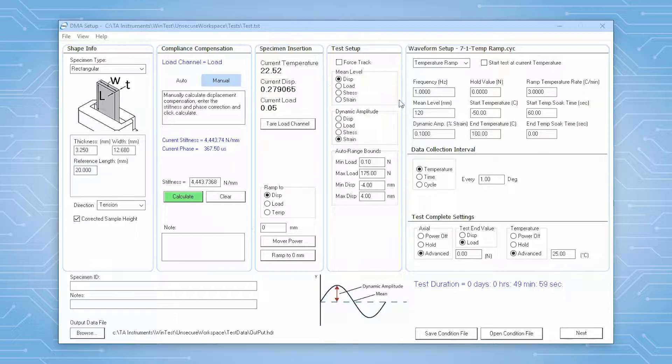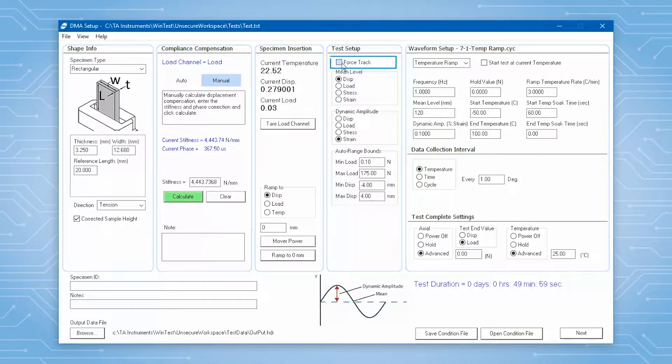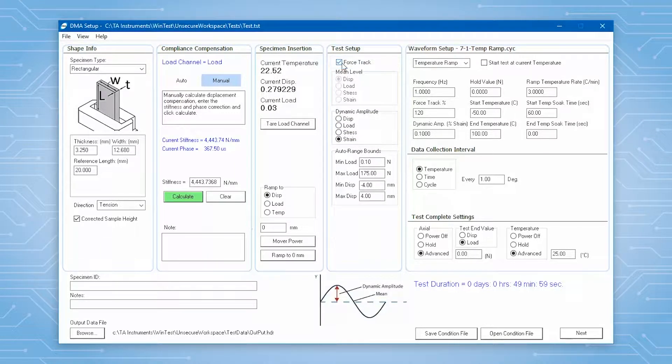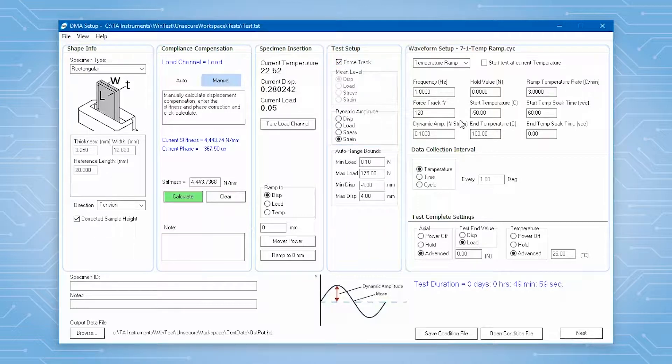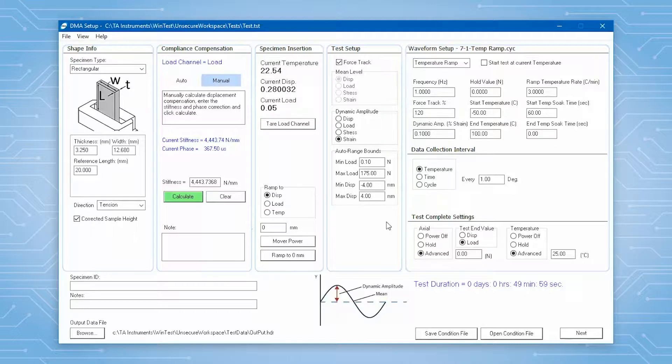In addition, there is the option to turn on force track for mean level control and set up auto range bounds in this panel. These two options help you to better monitor your test when your sample changes during the course of the experiment.